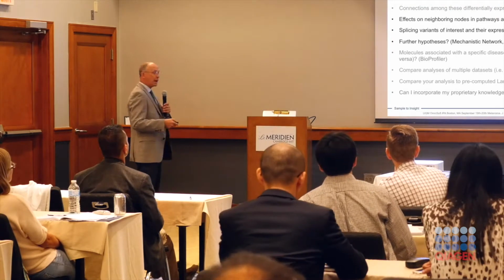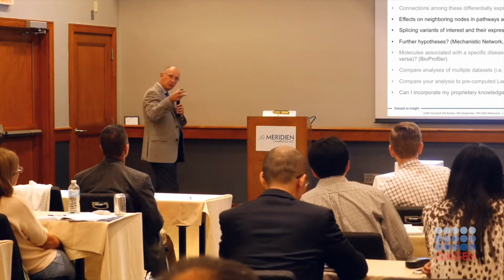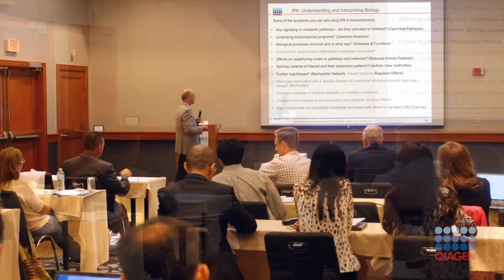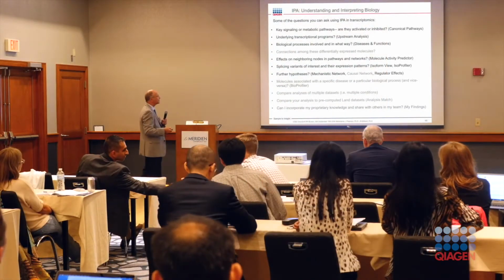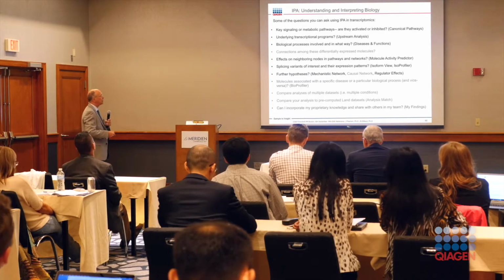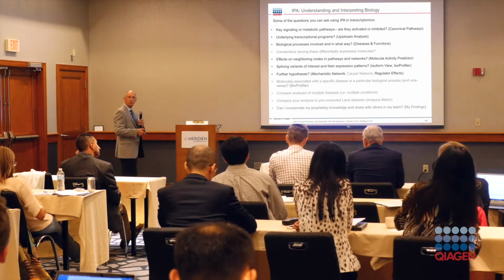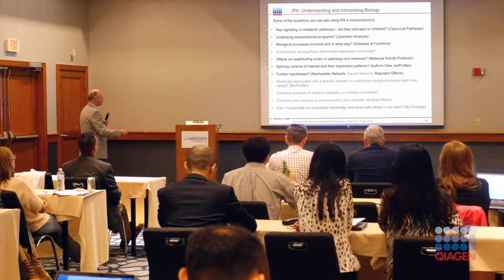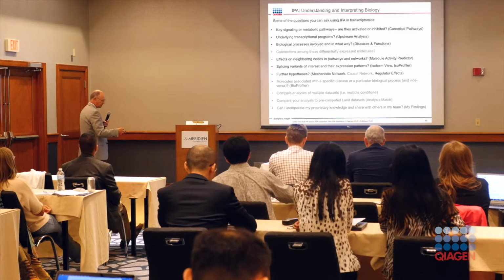We can compare within a particular dataset up to 20 observations. More importantly, and I will show that this afternoon, we can compare your own analysis to pre-computed data sets using the Analysis Match feature, which is releasing at the end of September. And that's really the power of the integration with Omicsoft here.